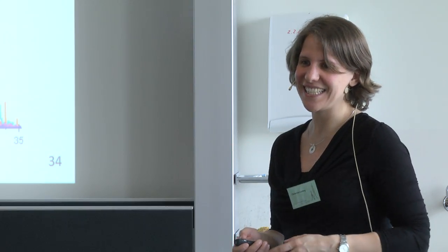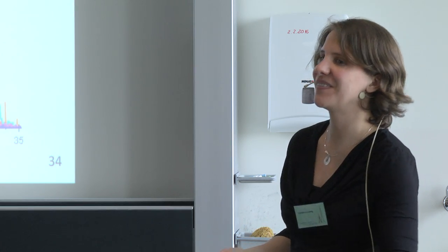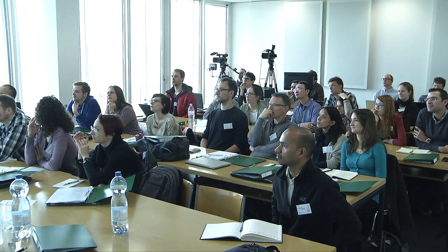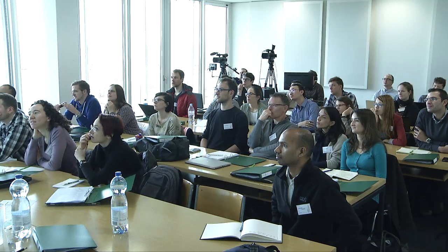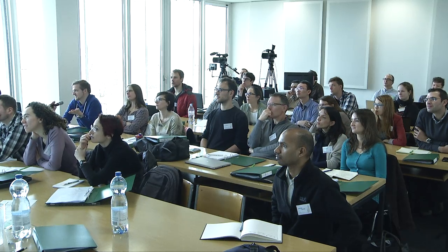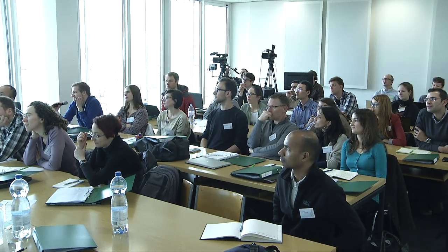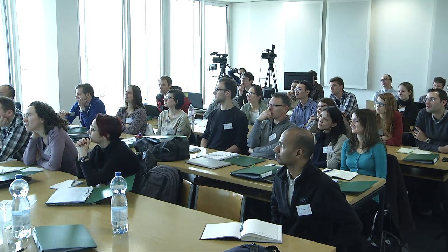So why do you think it's the 23? I mean, the most intense peak is the Y9, and not all the time, but most of the time, the longer the peptide, the higher intensity peaks you get. It's not always the case, no? No, not at all. But okay. Just my guess. This I wouldn't agree on.